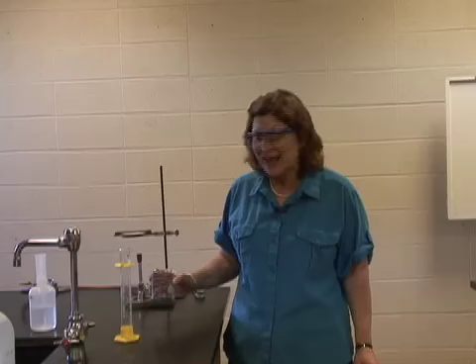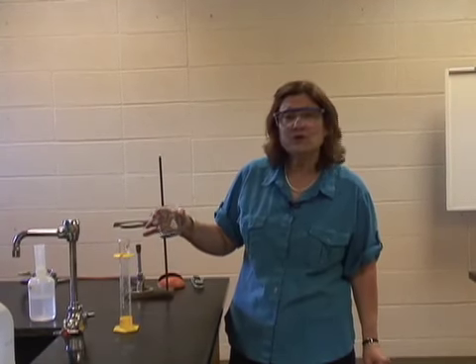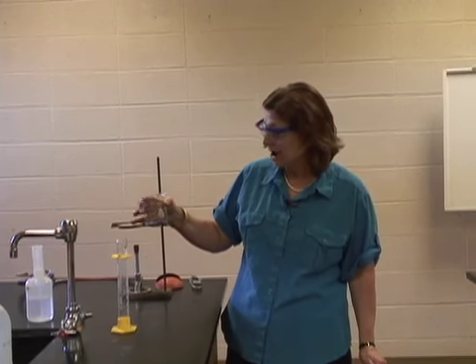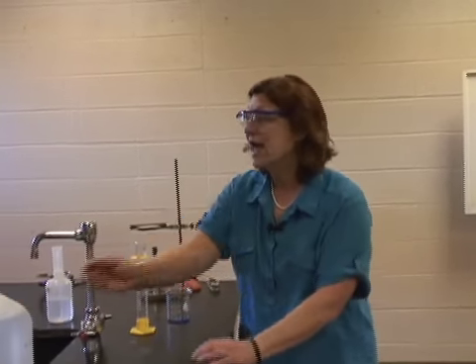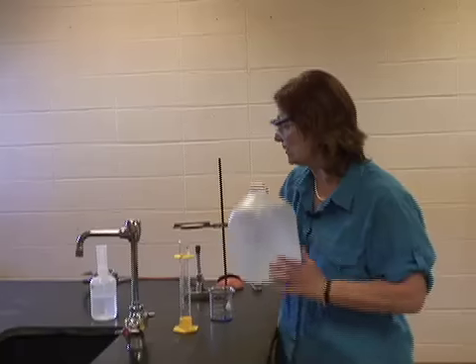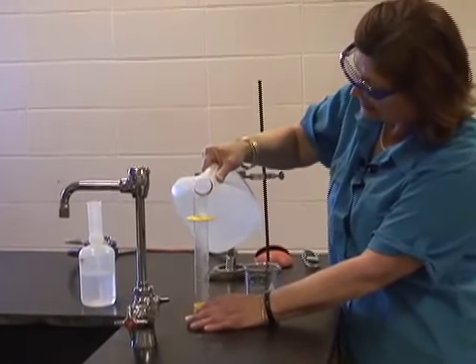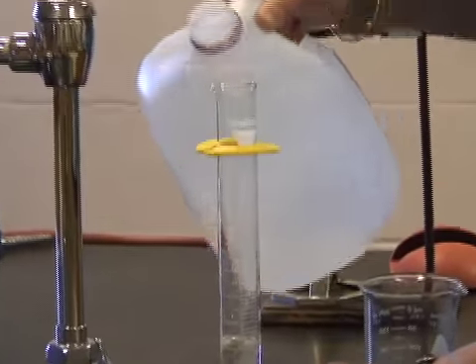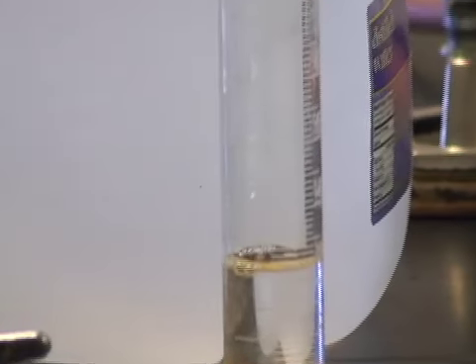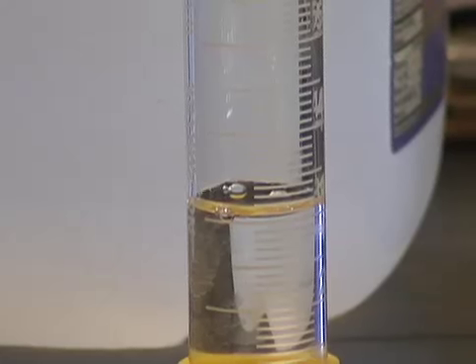Well, here we are at the lab station. I have my solution that I have produced in step 1. Now I'm going to add 100 milliliters of distilled water. I always like to use distilled water whenever I'm doing a lab because I do not want any contaminants in there. And even though we've said this many, many times, we never pour materials back into their containers. Never, ever.